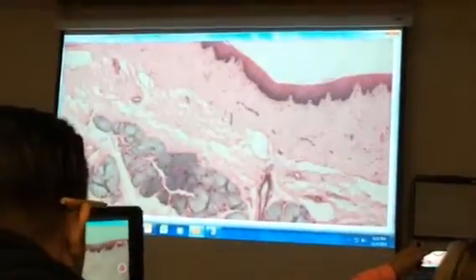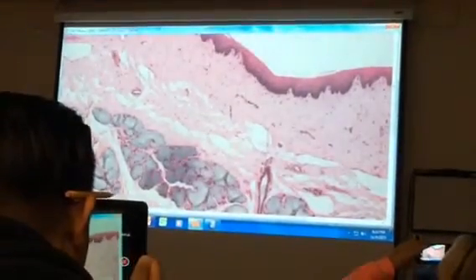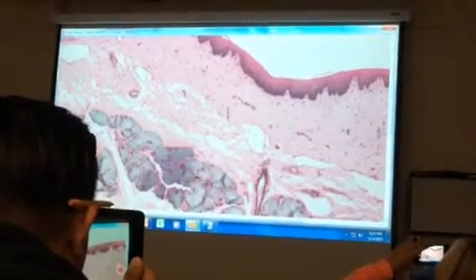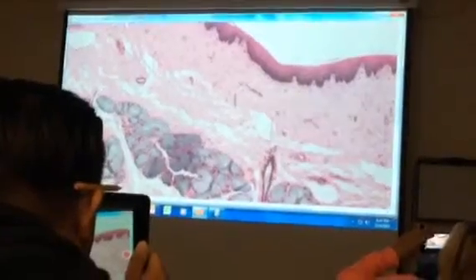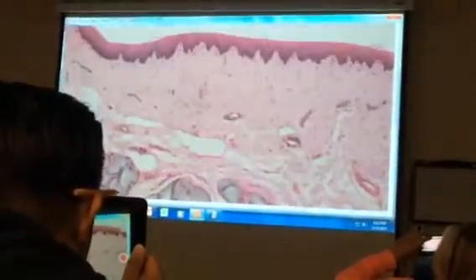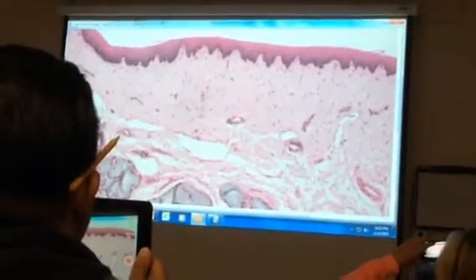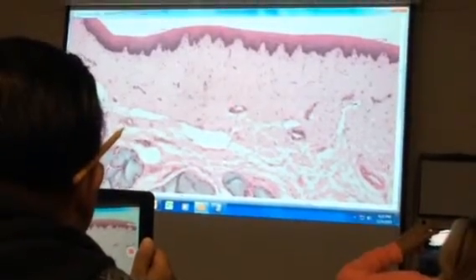Okay, so here's the lumen on the inside. So you've got the mucosa is going to start here, and it's going to go down. Kind of hard to tell where it changes, isn't it? Okay, probably right about down into here. Normally, you would have the muscularis mucosae, that little band of smooth muscle, right down in here, and that would be a good marker for telling you that it changes to submucosa. But in this part of the esophagus, there really is not one. It's almost none at all.